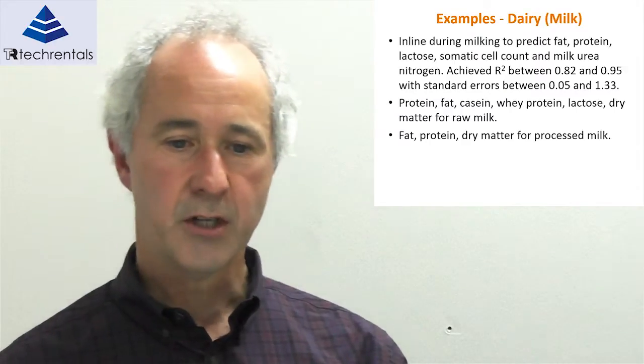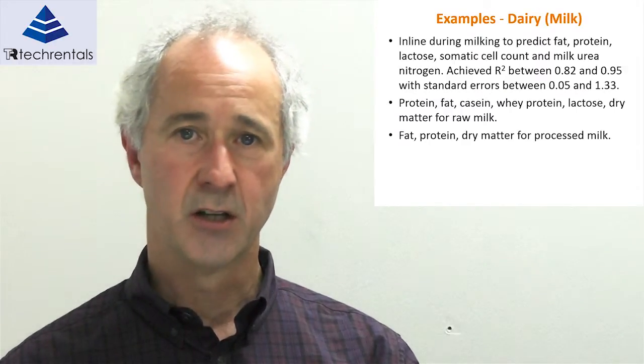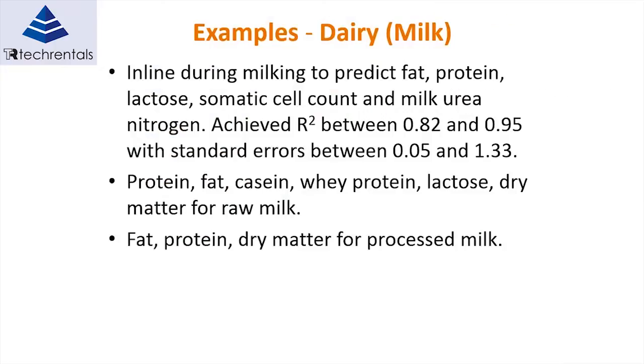As I mentioned already, just about every dairy in the world now would have near-infrared spectroscopy used to measure the fat and protein and lactose of the milk, whey protein, fat, processed milk.